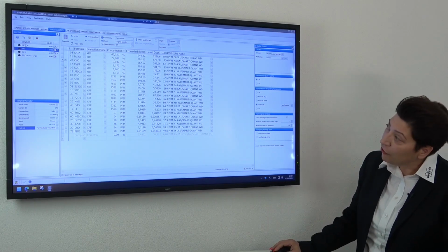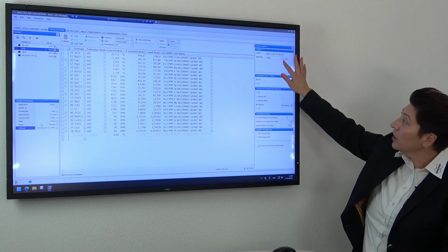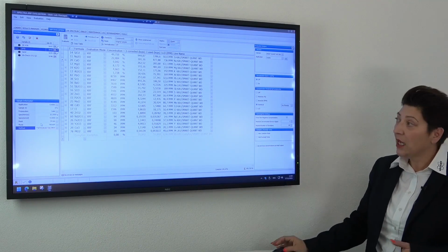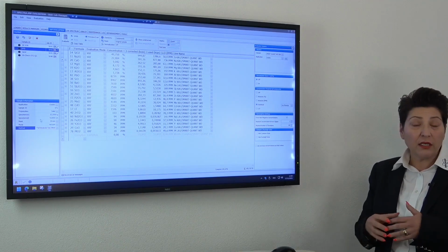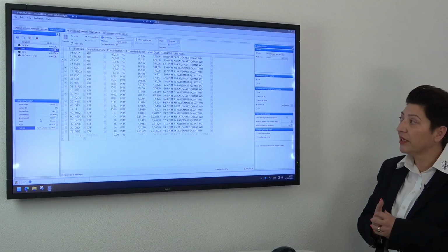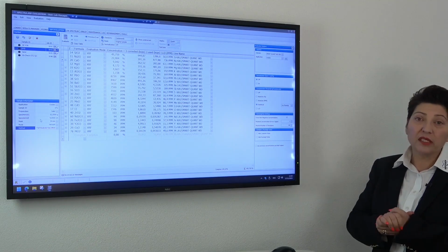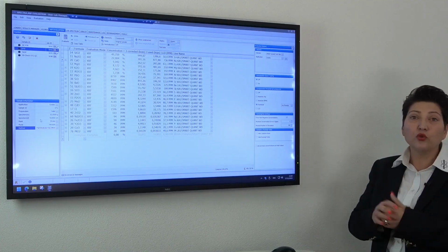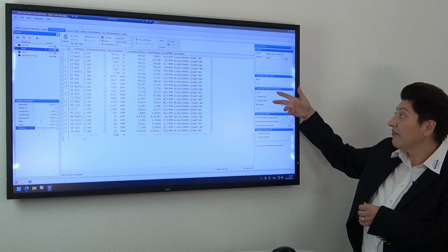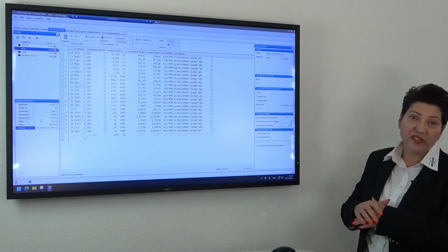Here, now we can see for this sample, we have some more sample properties which are given here. You see the model which is used is called oxide. So this means the results are presented as oxides. You can also make changes in the evaluation. So you can set something as a matrix or fixed compound. I will show this in the next few samples. And then you can also exclude some elements. Maybe you have some elements identified as false positive. So here you can do a manual reevaluation. You can use normalization off and on. You can have a threshold, which is defined by different parameters. So here you have a little bit more evaluation options that you can change.